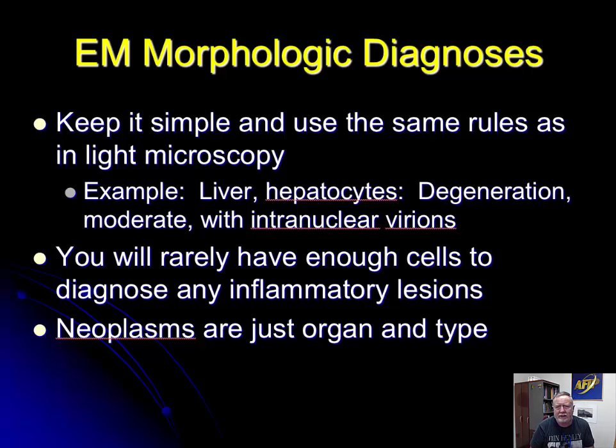Before we launch into the lecture proper, let me give you one or two other bits of advice about ultrastructure. I'm someone that gets a fair amount of ultrastructure brought to me. Hey, what do you think? And what I see are errors generally in the same area over and over, or maybe slight variations in the same area. And this is people that want to overinterpret what they see. We're going to look at some slides which have organelles that may be misinterpreted, and it's a very common thing.